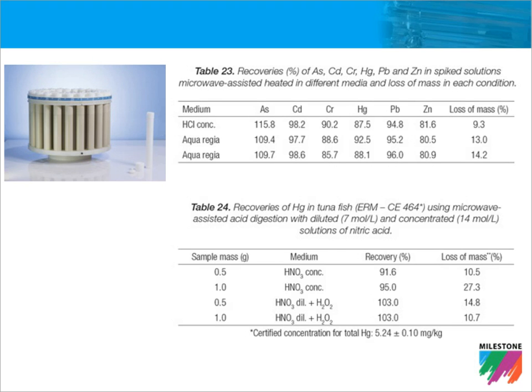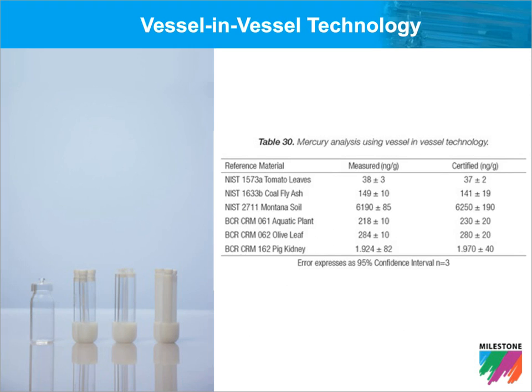The vessel-in-vessel technology was also discussed in the Clean Chemistry book as a special strategy for trace analysis. In the Clean Chemistry book, it was discussed how the vessel-in-vessel procedure can deal with high masses of samples without increasing the internal pressure of the vessel.